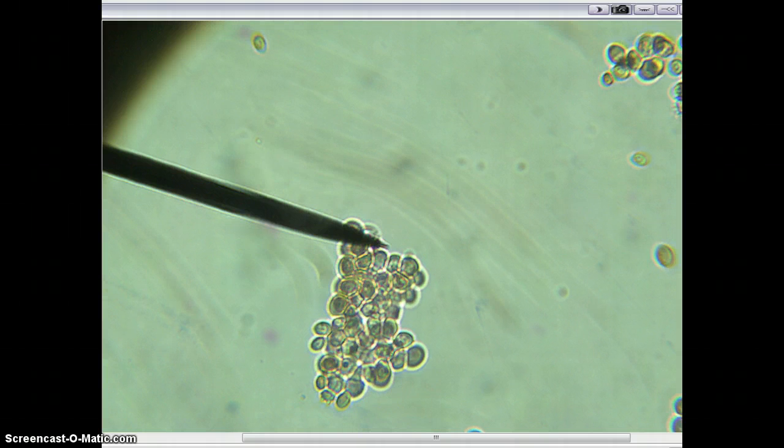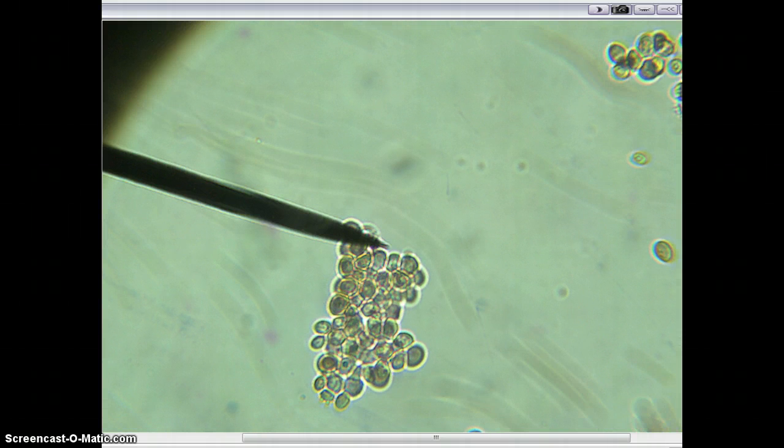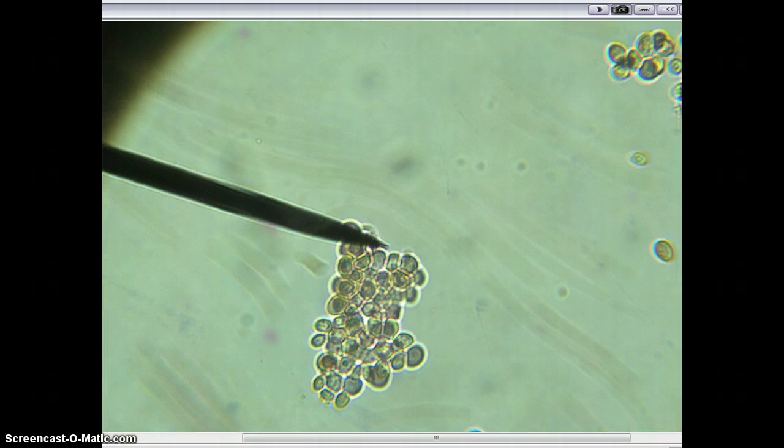If it was osmosis, diffusion, or facilitated diffusion, the dead cells would have the color on the inside, because it would just go through the membrane. Remember, no energy is needed, so it doesn't matter if the cell is living or dead.